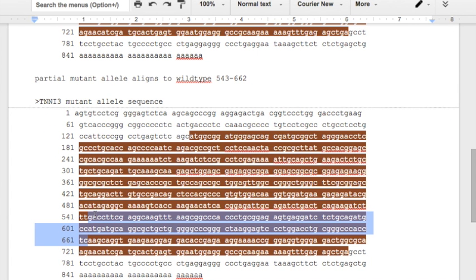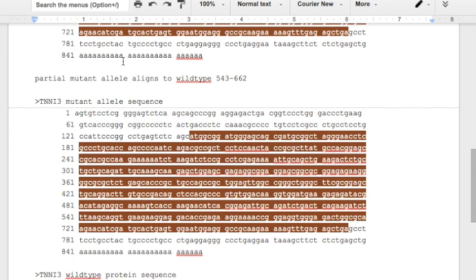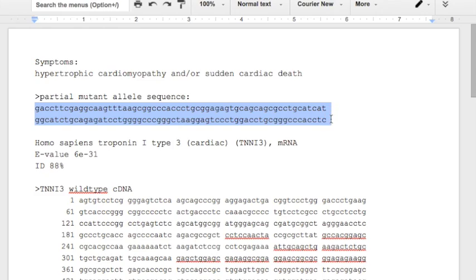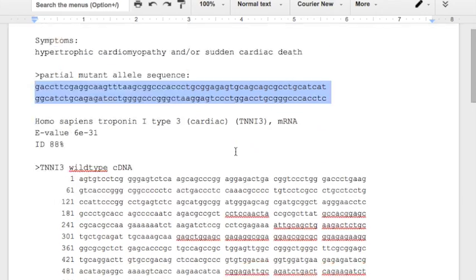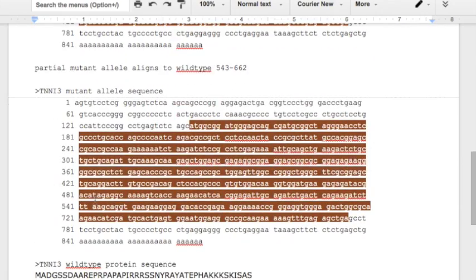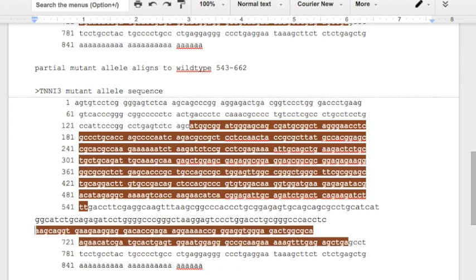And watch. All I have to do, hit delete. Take our partial sequence. Copy it. Paste it into this location. And now we have a complete mutant allele sequence. It's certainly not pretty, but we have the complete sequence here. The numbers might not be ideal, but it's correct.